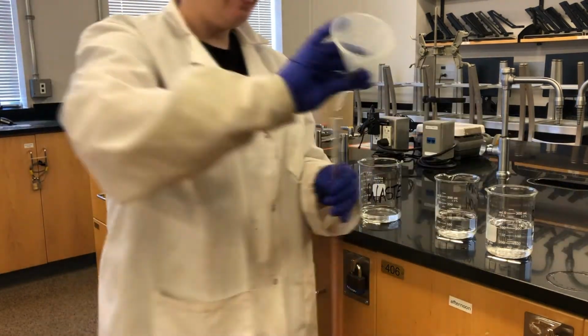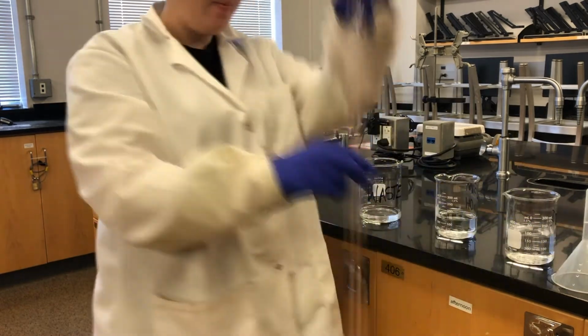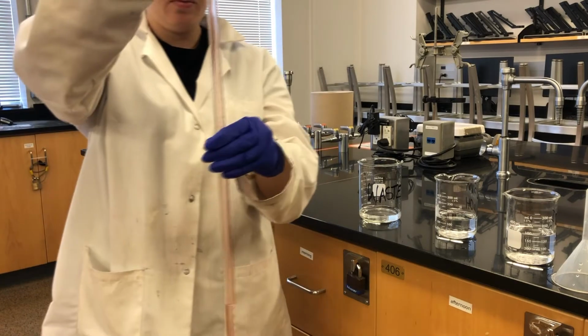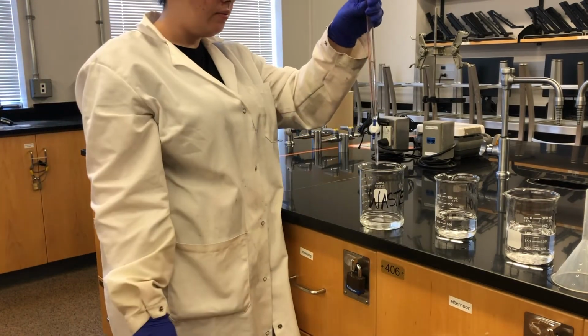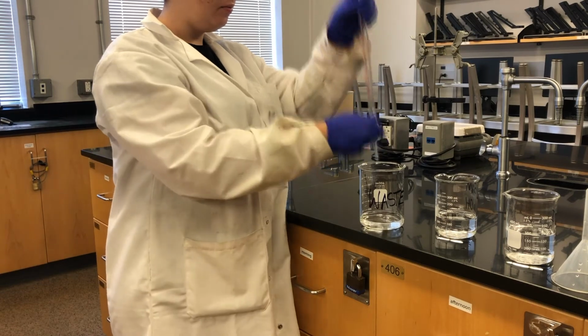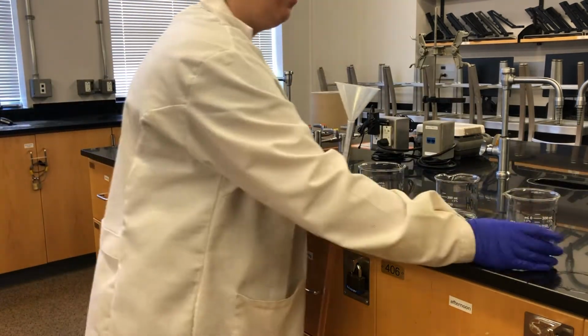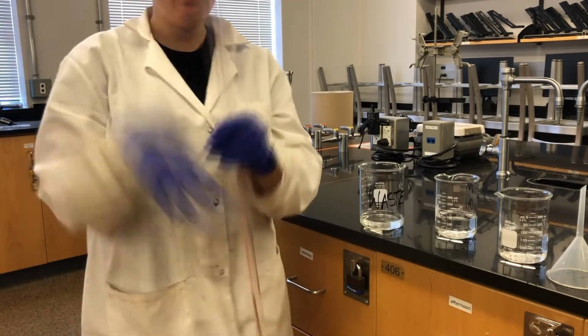Next, we condition and prepare our burettes for the titration. To condition a burette, we use a funnel to add a small amount of liquid to the top. Then, using a gloved hand, we cap the top of the burette with a thumb and gently invert the burette multiple times to rinse all of the internal surfaces of the glassware. Lastly, we drain a small amount of the solution through the tip before discarding the conditioning liquid.